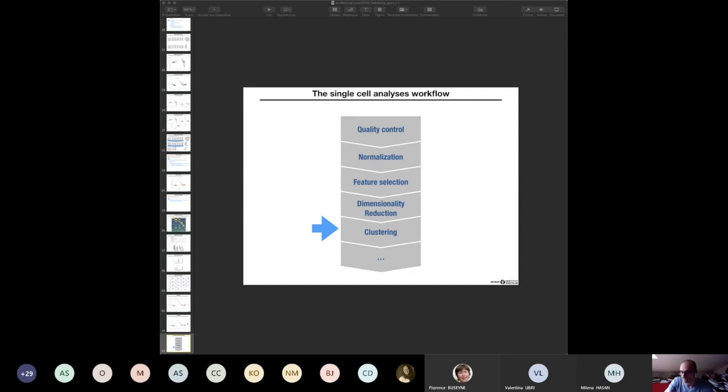I could maybe have gone up to 3,000 or 4,000. I haven't had the time to test different thresholds, but it's a fine balance between how much added information these genes will give you compared to the noise they will bring. So it's something that needs to be finely tuned during the process. But no, not keeping all the genes.